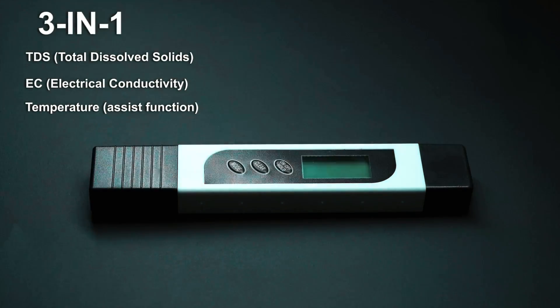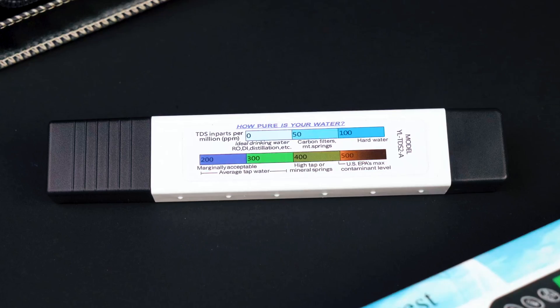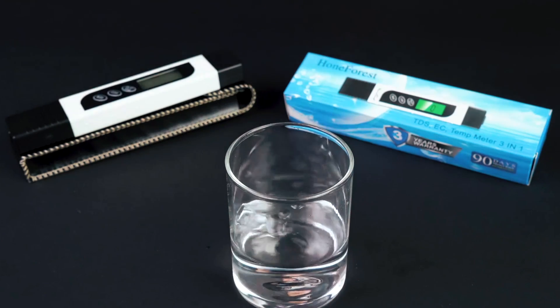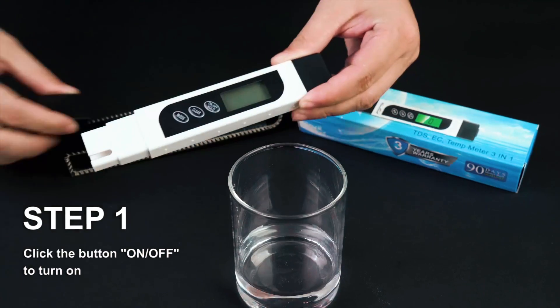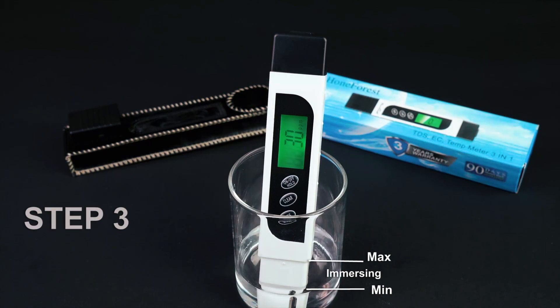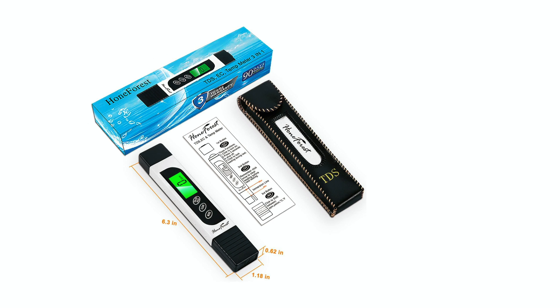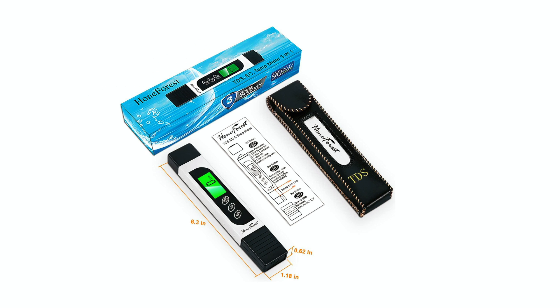The tester features an auto-lock function, which holds the result for easy viewing and automatically shuts off after two minutes to conserve battery life. With a measurement range of 0 to 9,990 parts per million and built-in temperature compensation, this is a reliable tool for household and professional use. It's especially useful for testing water from filters, wells, and storage tanks.